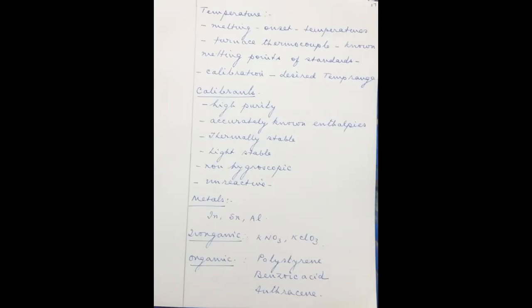Number three, the substance has to be thermally stable. Number four, the substance has to be light stable. Light stable means it should not undergo any photochemical change. Number five, it should be non-hygroscopic.